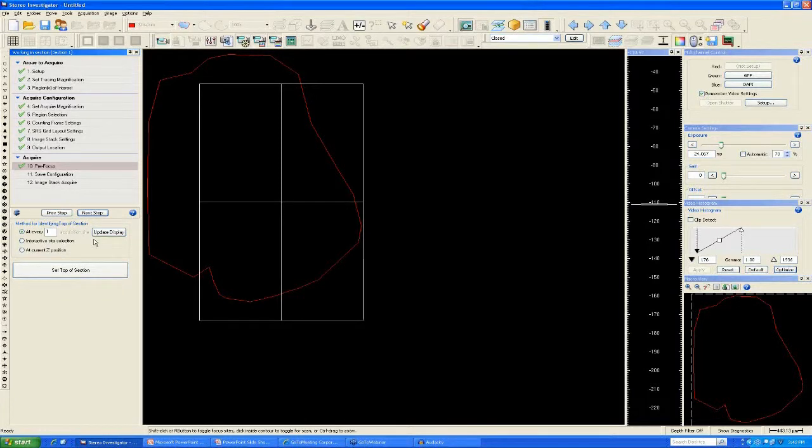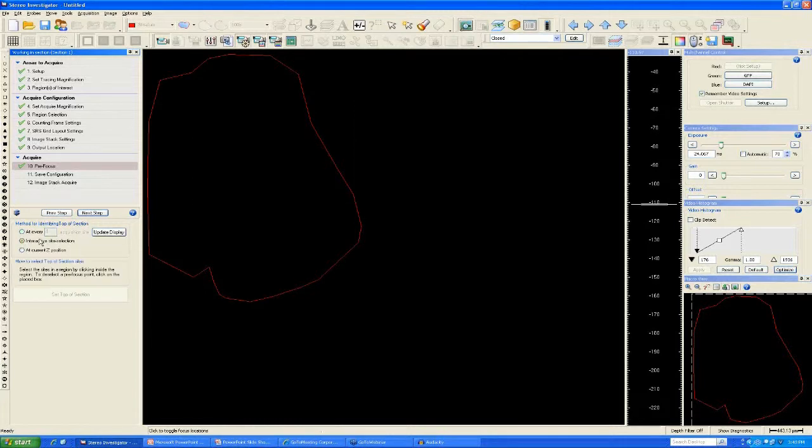Alternatively, interactive site selection is possible. In interactive site selection, the user selects locations upon which to go through and measure tissue tops. By hitting the top of section button, the software will then take me to these locations where I will focus at the top of the tissue.